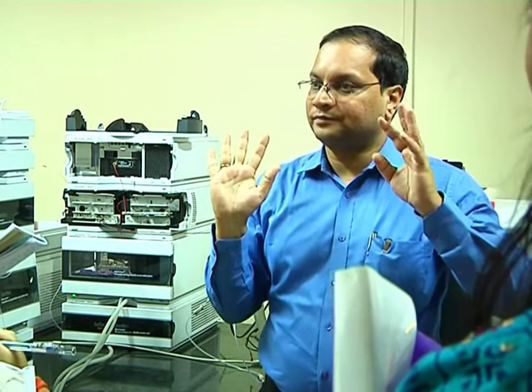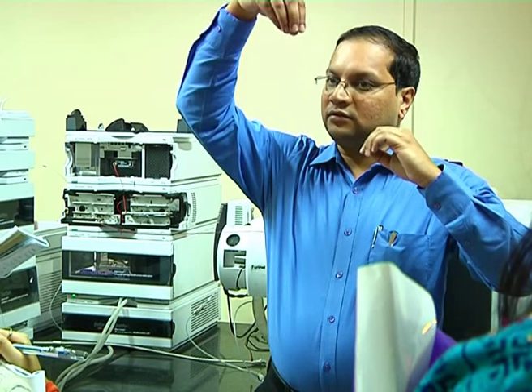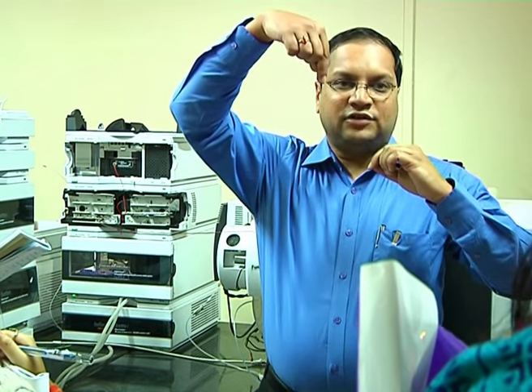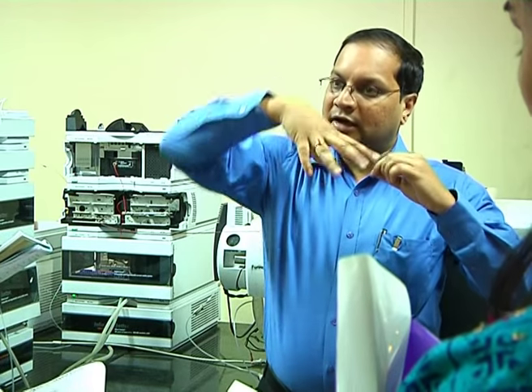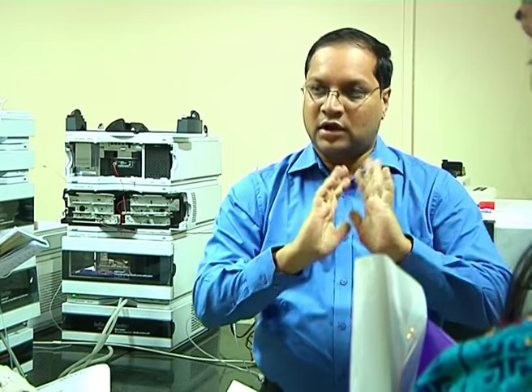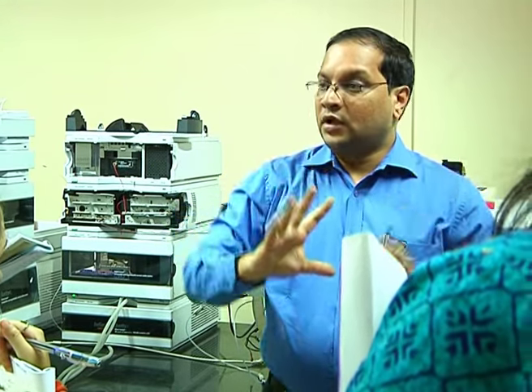That is the objective. So what is being done here is a stream of liquid, then there is a nebulization gas which is nitrogen, and the liquid is sprayed out. You are pushing gas around that nozzle so that it gets sprayed off. You have split the stream of flow into a small spray, and the source is heated at typically 300 degrees centigrade.